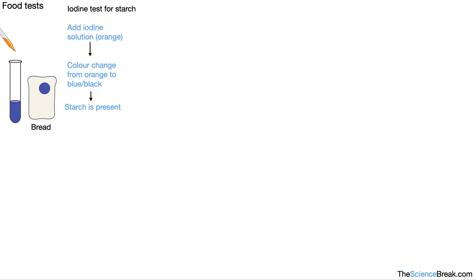So that's our iodine test for starch. One more thing to note here is that the darker the color, the more starch there is present.